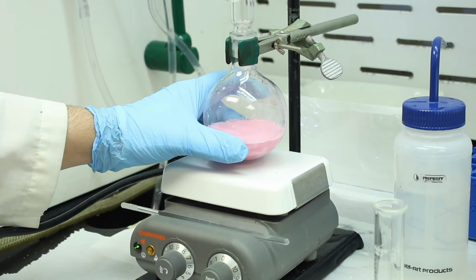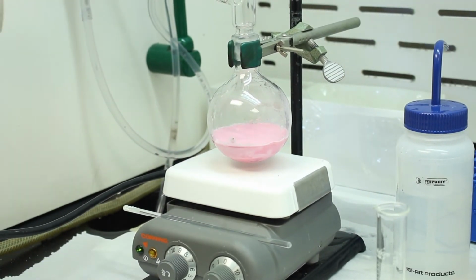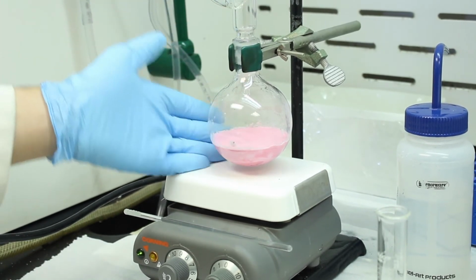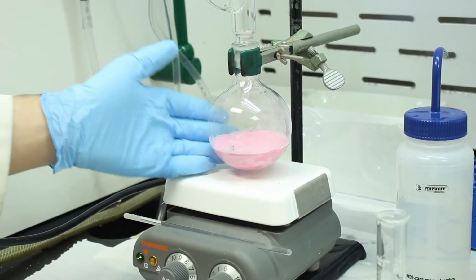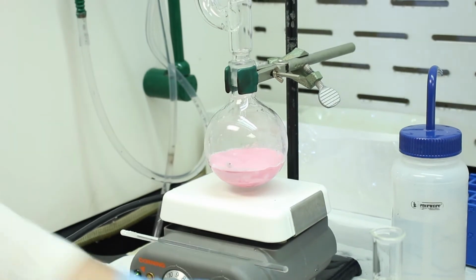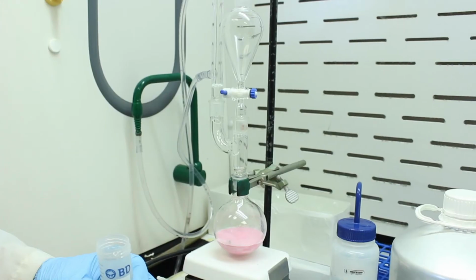Okay, so now we can get some hydrochloric acid. We'll place the hydrochloric acid in the sep funnel, and then we'll drip it into the reaction. Here we don't really care about getting air or water in the mixture, since the Grignard is complete. So in fact we can remove some stoppers here. Okay, so we'll get the hydrochloric acid, and then we'll begin adding it.